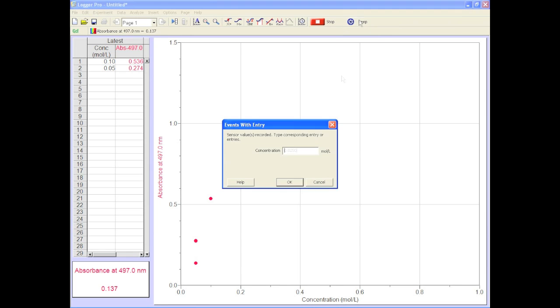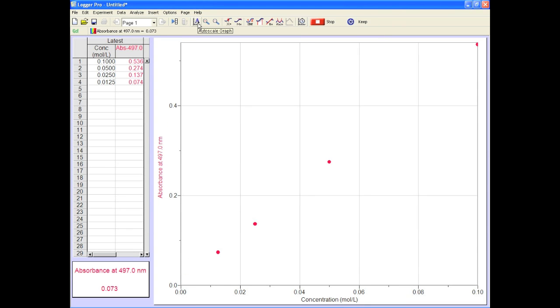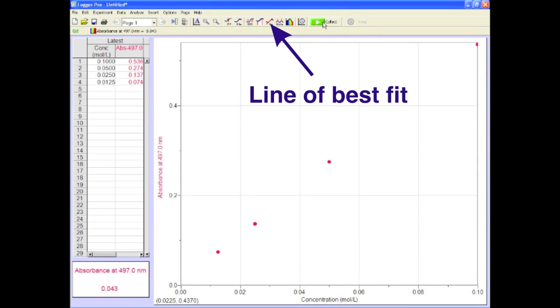Go on down the line until you've entered all your calibration standards. When you're done, press Stop and auto-scale the plot. Hopefully the points line up nice and straight. If not, something went wrong and you may have to prepare your standards again, or maybe there were air bubbles in your cuvettes. If there is a line joining the points, get rid of it in graph options by checking off connect points and checking on point protectors.